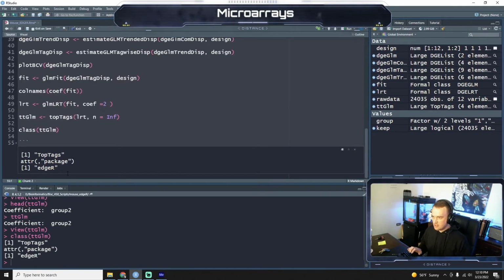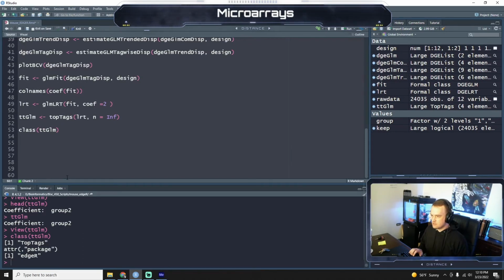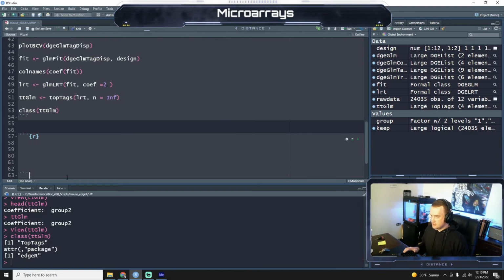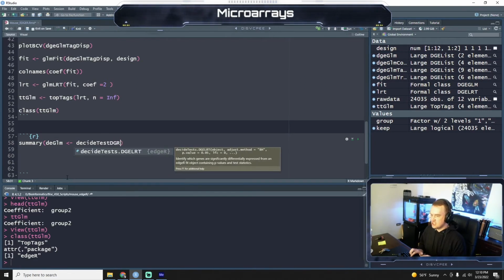So I'm going to create another. What's going on here? Oh, let's close this out because we're getting into too much in a chunk here. All right, so let's run a summary on DEGLM, and we're going to use the decide test. DGE.